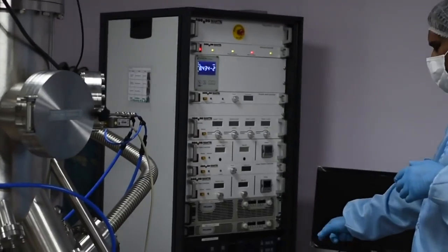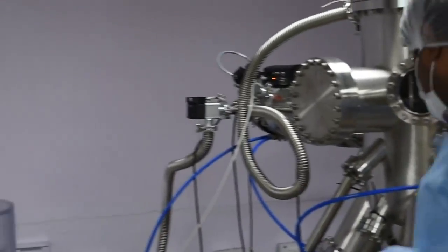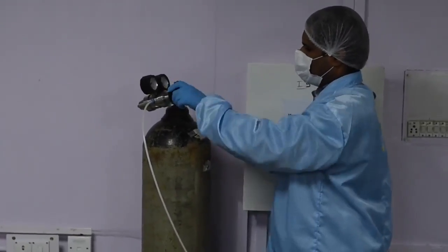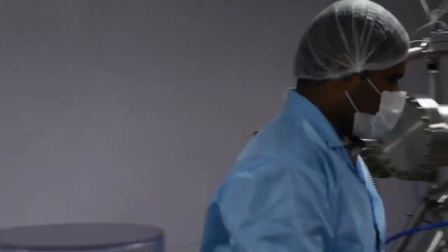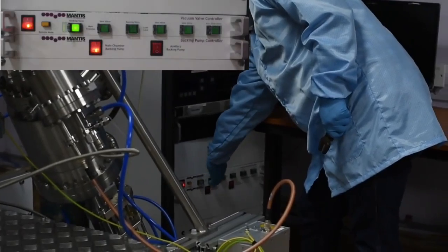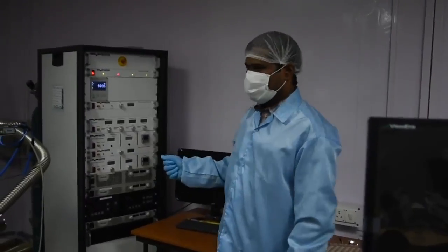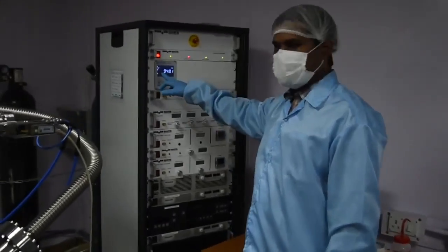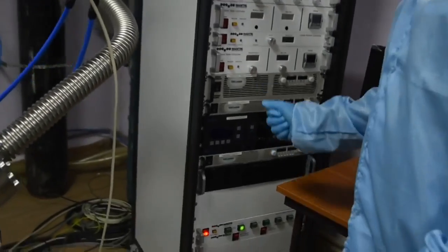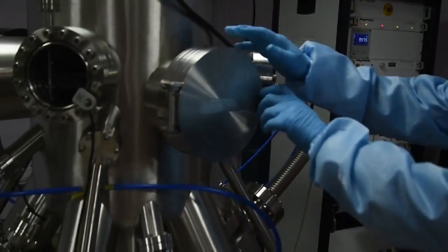By means of the control unit we will perform the venting. First we turn on the nitrogen gas, then on the control panel I am switching the vent valve. Now you can see venting has been done and the atmospheric pressure has come to 1 bar, that is 1000 mbar. Now that venting is complete, I can remove the chamber door.